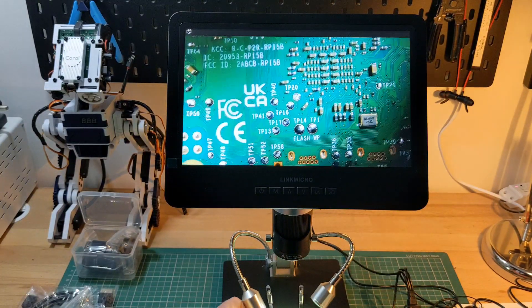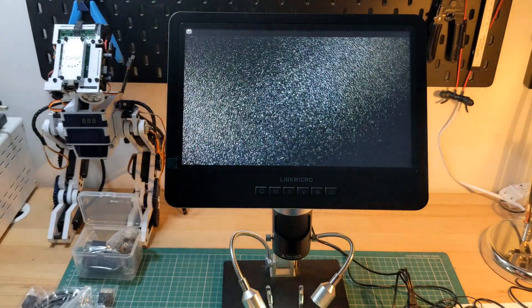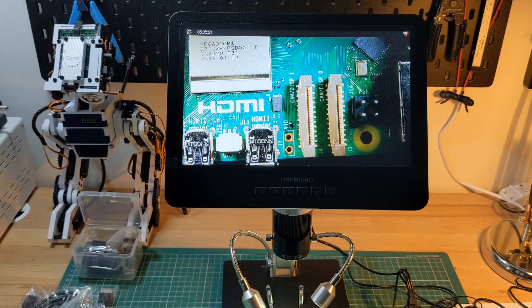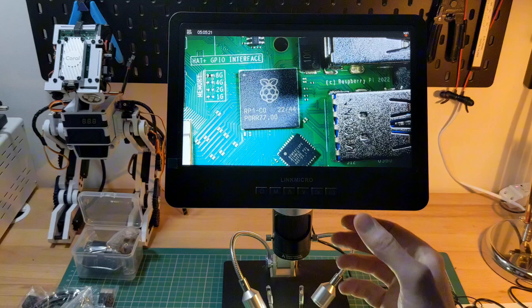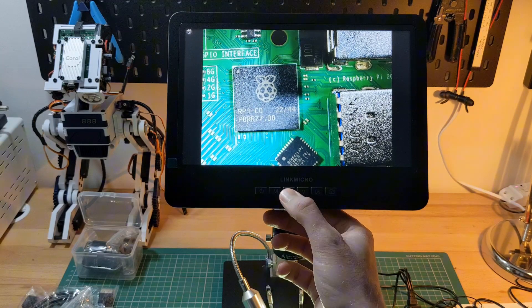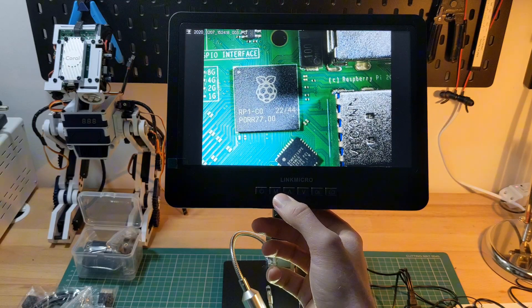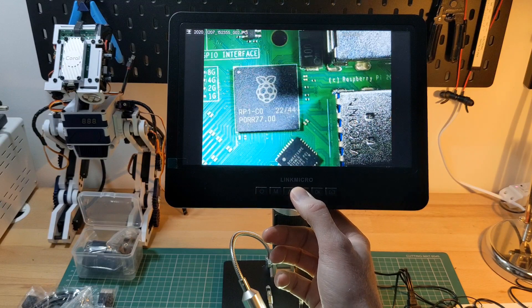There's also the option to capture images from the microscope using a button on the screen, and even a remote control, so that the images can be captured without disturbing the microscope. This is especially useful for the 2040x lens, where any slight movement can cause the image to blur. You can also view the stored images on the microscope itself, or remove the SD card for upload onto a computer.